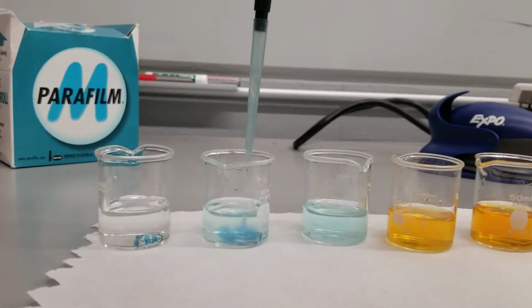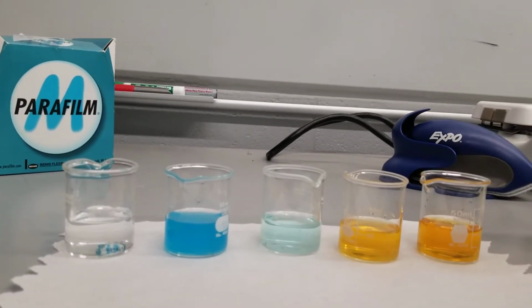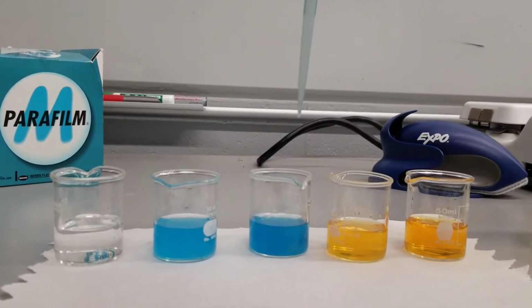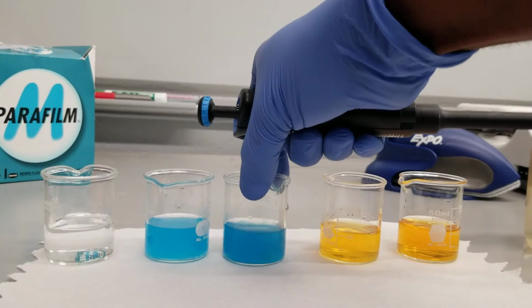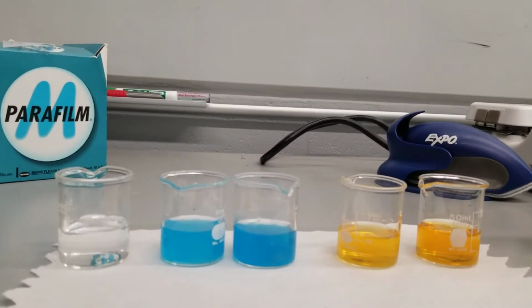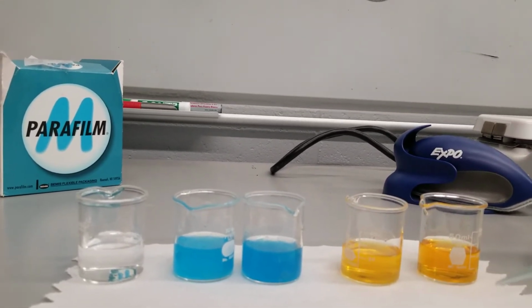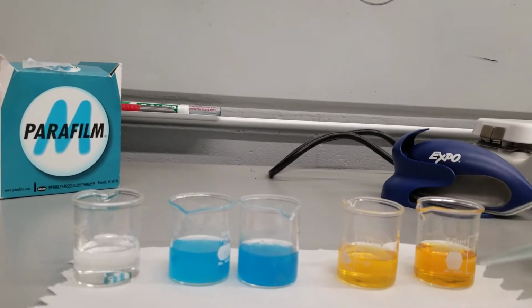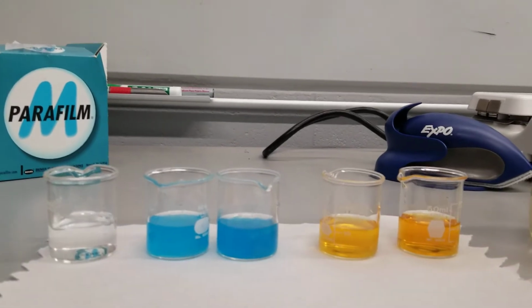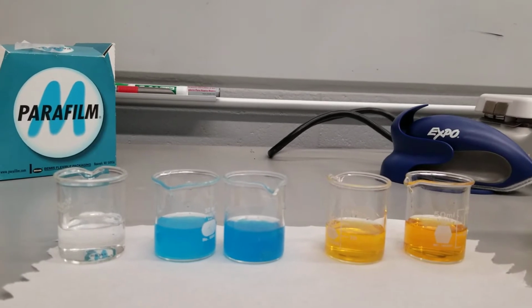The first one here gives us a deep blue color right away, and that's an indication of the presence of high amounts of copper in that water sample. Again, the next one gives us another deep blue color. That also is copper. I would like for you to pay attention to both of them and tell me which one you think has a deeper blue color, which is indicative of a higher amount of copper in the sample, comparatively speaking.